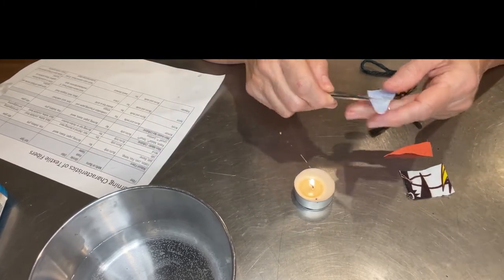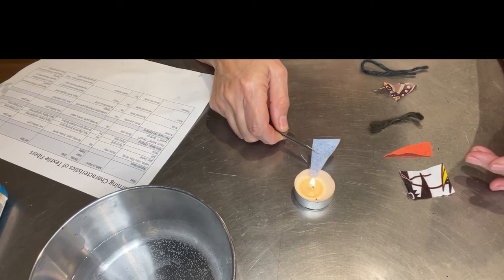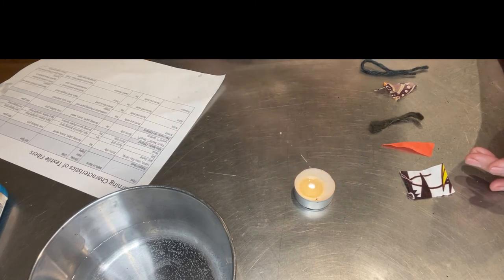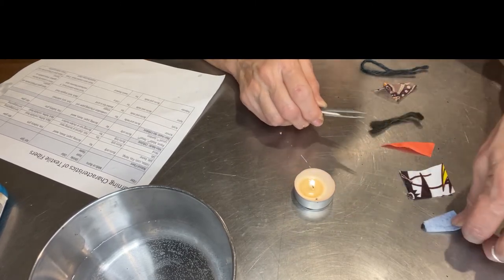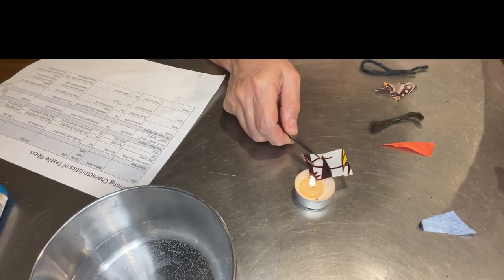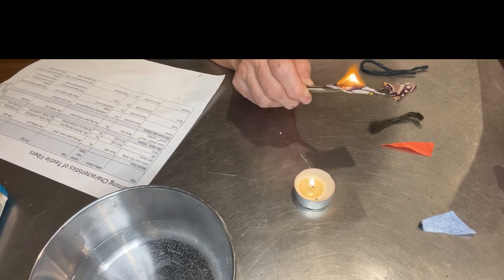I'm going to take this shop towel — it's polyester. I'm going to hold it close to the fire: it shrinks a little bit, it catches on fire, it stinks. I'm not going to touch it right now because it's hot. This one I think is cotton — it doesn't shrink, it just sets itself on fire, and this is not going to put itself out.